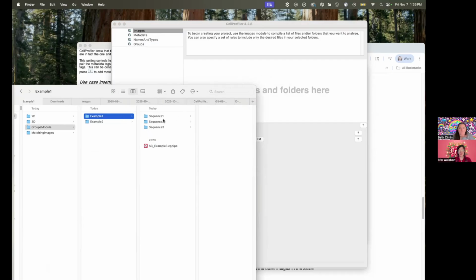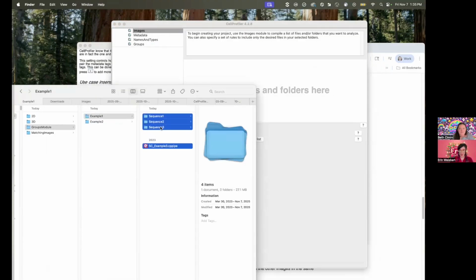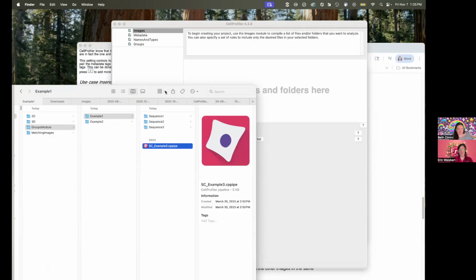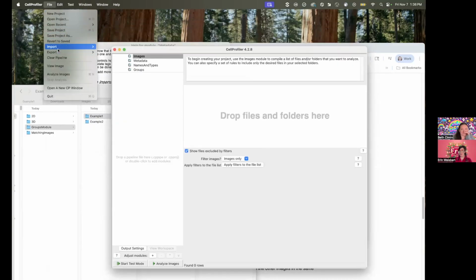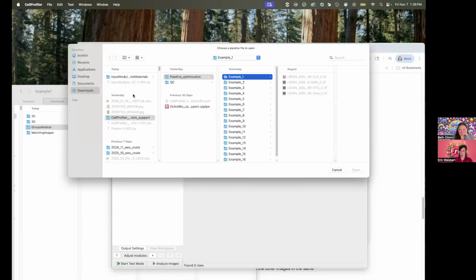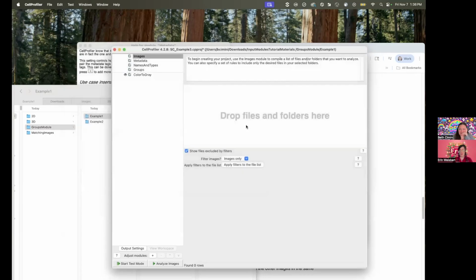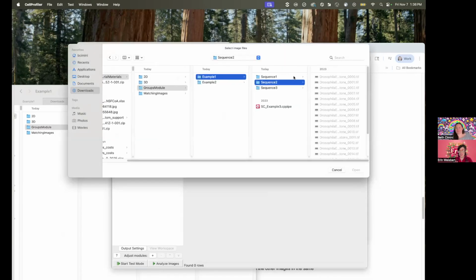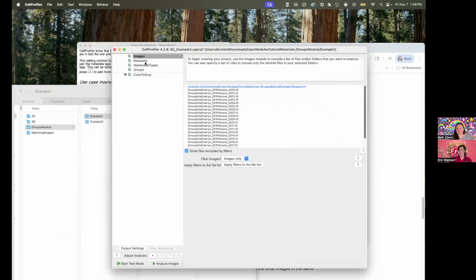While you're loading that in, I will say we also have an earlier Ask Erin, Dear Beth episode that introduces using load data CSVs. That is an alternative way, if you never want to deal with names and types, even though Beth has so nicely demonstrated that it's really not that bad and Erin just has a chip on her shoulder. If you still have that chip on your shoulder, go check out our earlier episode of Ask Erin, Dear Beth about load data CSVs and passing load data information into CellProfiler as an alternative that doesn't require using these input modules.